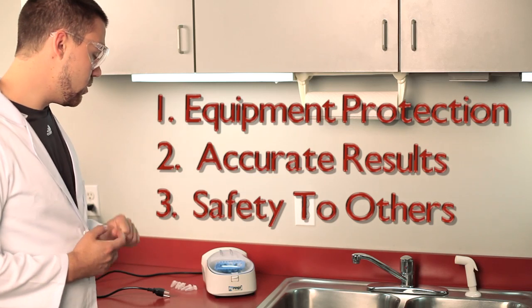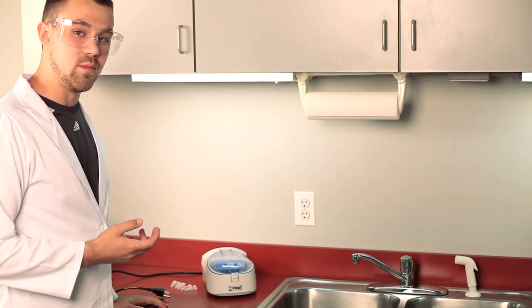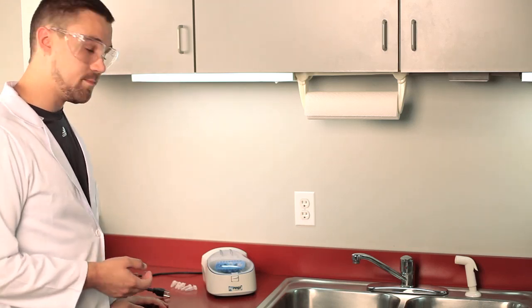So today we'll be working with the Centrifuge 12, and I'll show you a few different ways in which you can balance this centrifuge, even if you don't have a balance tube. So let's get started.